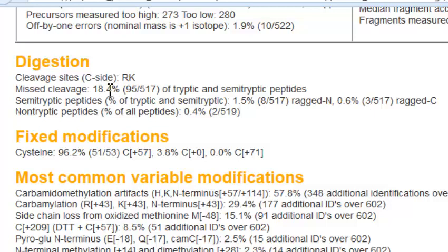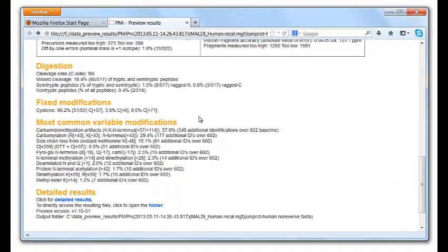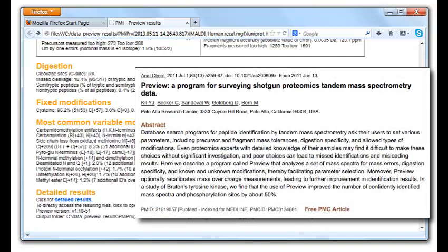Almost 20% of the identified peptides included at least one missed cleavage. Preview counts duplicates, so the 517 identified peptides include fewer than 517 distinct sequences. There are actually many more identifiable peptides in this dataset, but in order to achieve its speed, Preview limits attention to peptides from the 100 top proteins. This cuts down the total number of identifications, but it does not bias the reported statistics on mass accuracy, digestion specificity, and in vitro modifications, which are not usually protein dependent.